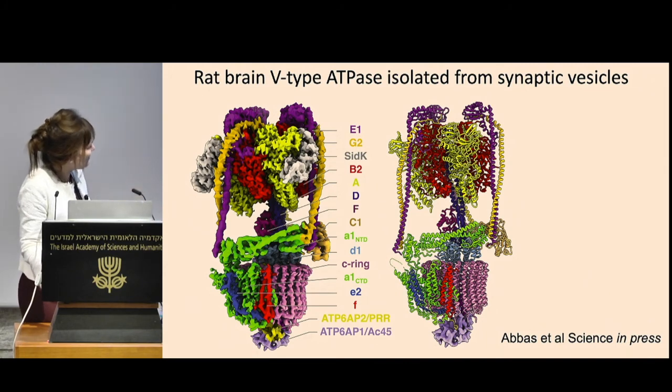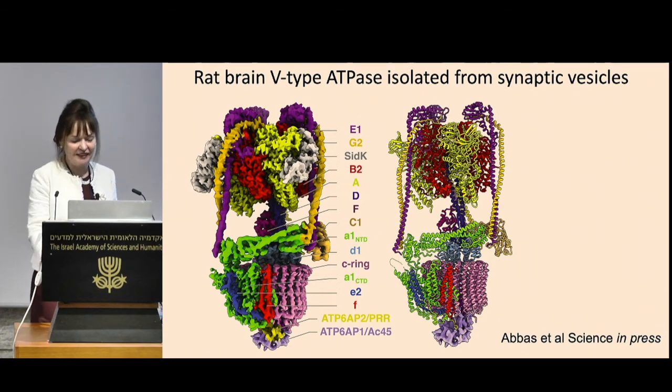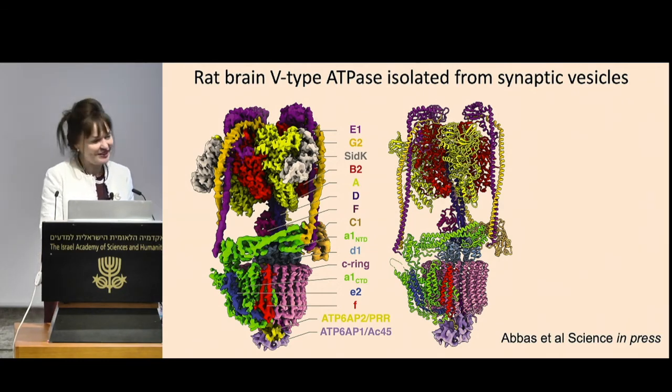But all of this was confirmed by proteomics, lots of different subcomplex formation. And it has to, of course, be rigorously tested in all different fragmentation pathways and lots of different programs. So it's not true that we just guess our assignments.